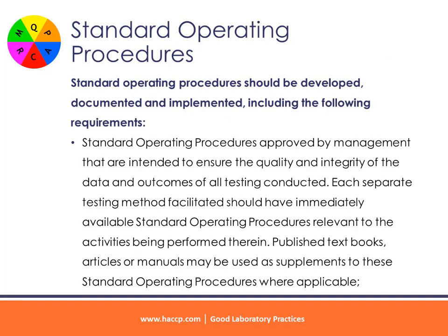Standard operating procedures. Standard operating procedures should be developed, documented and implemented, including the following requirements: standard operating procedures approved by management that are intended to ensure the quality and integrity of the data and outcomes of all testing conducted. Each separate testing method facilitated should have immediately available standard operating procedures relevant to the activities being performed therein. Published textbooks, articles or manuals may be used as supplements to these standard operating procedures where applicable.